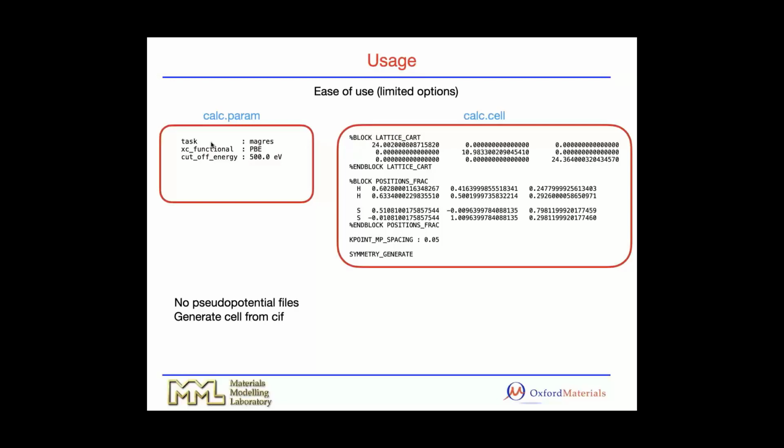In order to do a good calculation, you're going to need to converge it. You're going to need to make sure you've used a good enough basis set, and that you've converged your k-point spacings. Those are the two parameters that you need to worry about in terms of getting a good, accurate calculation. Materials Studio, of course, can set very good defaults for you, but essentially those are the two free parameters, and that's it. So that's actually fairly ab initio, in terms of saying, give me an answer back. There aren't many options and keywords to play with at all with NMR calculations.